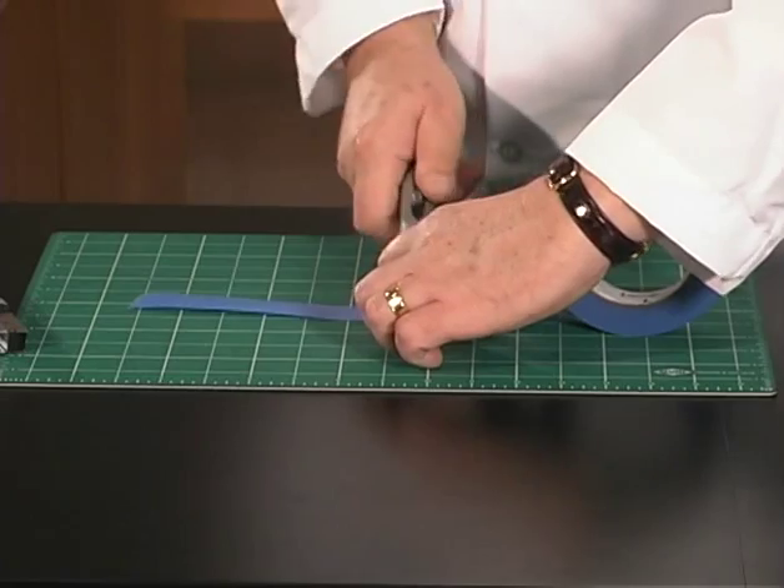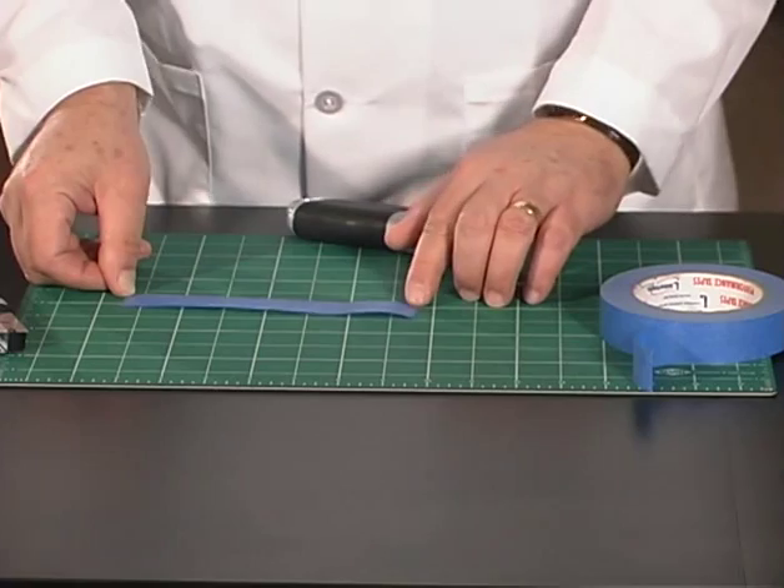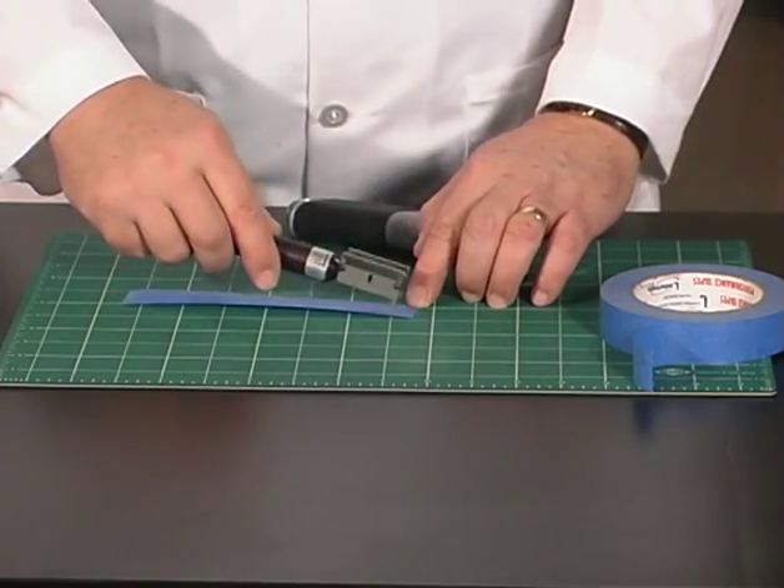In this example, the specimen width is greater than the test width. Use a specimen cutter to remove a test sample from the center of the specimen.